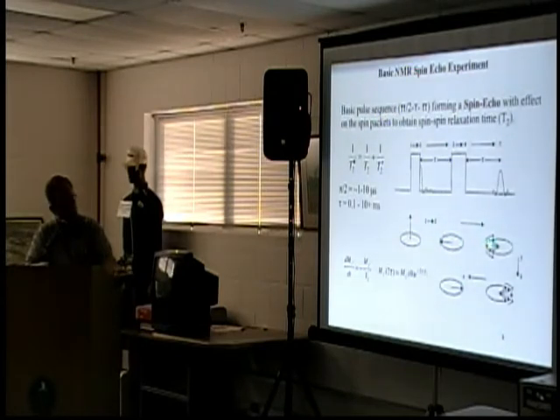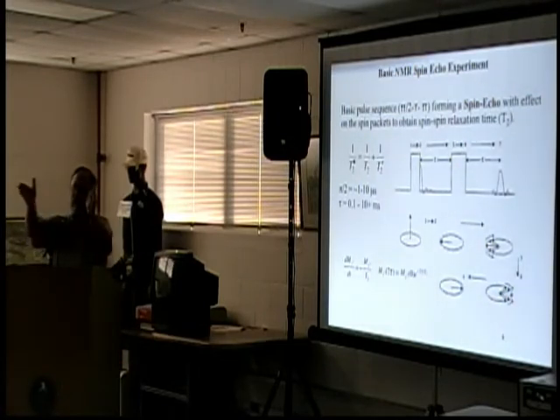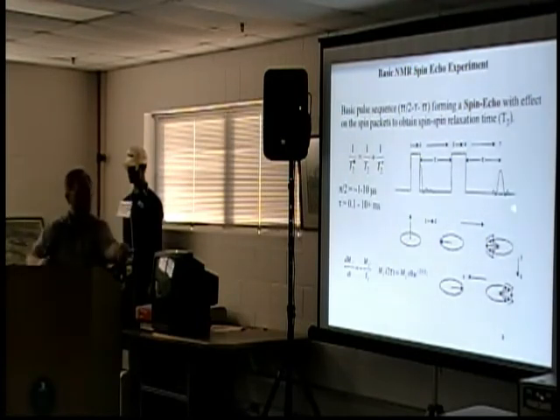Now what happens is it doesn't lose the energy, it just dephases all this magnetization. If you wait just long enough, the signal will disappear. You apply this 180-degree pulse, and the spins, which tend to disperse, now keep moving but move back and refocus. They refocus with opposite sign. So this one was pointed here, and this one comes back. This signal is not a phase detection, just a voltage detection, so it shows the same sign. If you're doing phase-sensitive detection, the signal will be inverted.